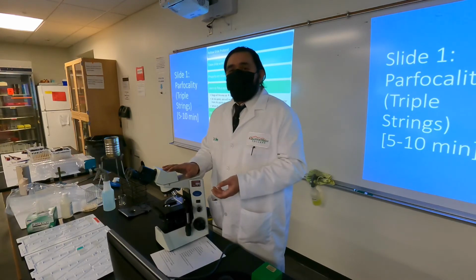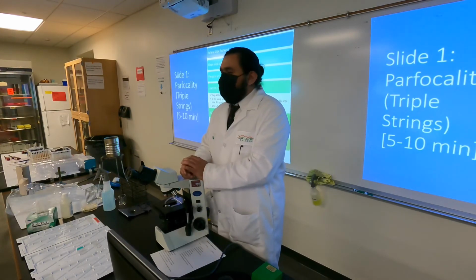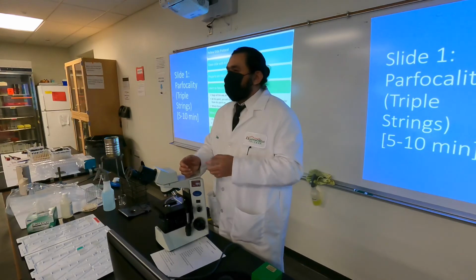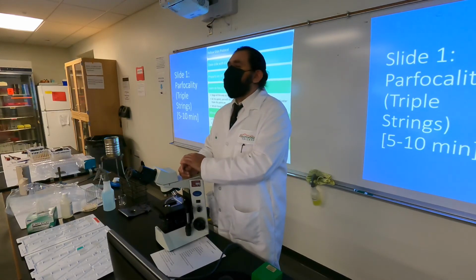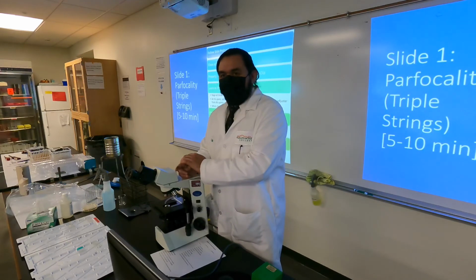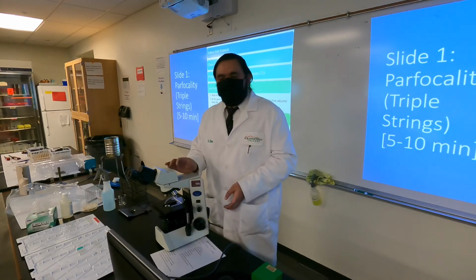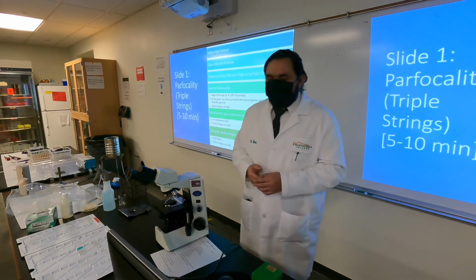However, quick heads up, if you're wearing glasses, remember that no matter how blind you think you are, because I am very blind too, the scope is magnifying things thousands of times. You don't need glasses, okay? So you don't need glasses to observe through these. You don't even need your contacts. This will do the job.